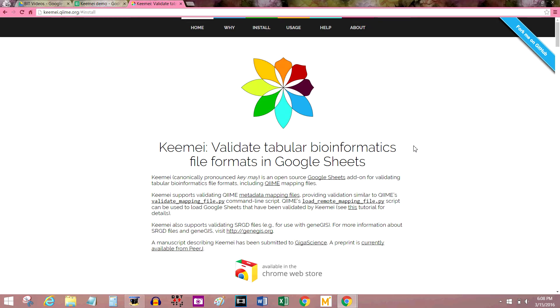If you've never used Google Sheets before, it's Microsoft Excel except it's run online so you can collaborate with others. Bioinformatics research is often collaborative, and the people who created Keemei wanted a faster way of checking that the data they were collaborating on was formatted the same way throughout an entire sheet and didn't have any very obvious errors.